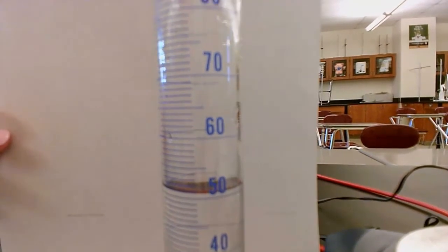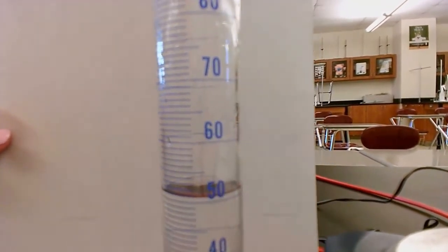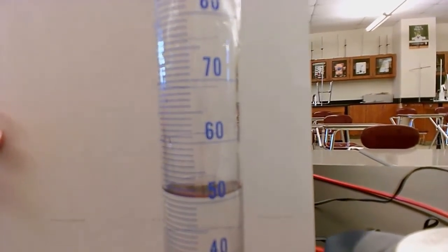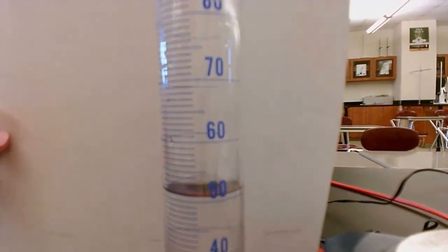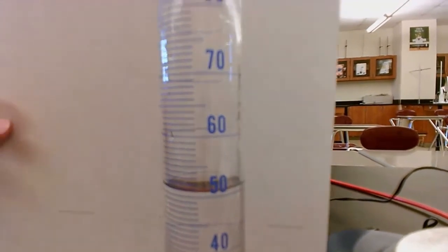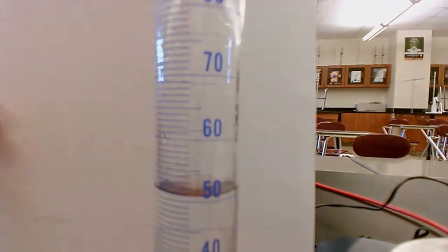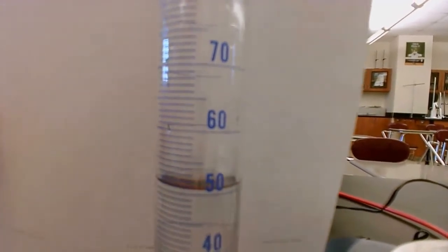So I think by now everyone has the volume. Make sure you record this in your data table. Or it might be easier if you want to just write things down and then move it into the data table later. So this is your volume. So far, we had a beaker that weighed 91.91 grams. We had 50 grams of water, and now we have this volume.